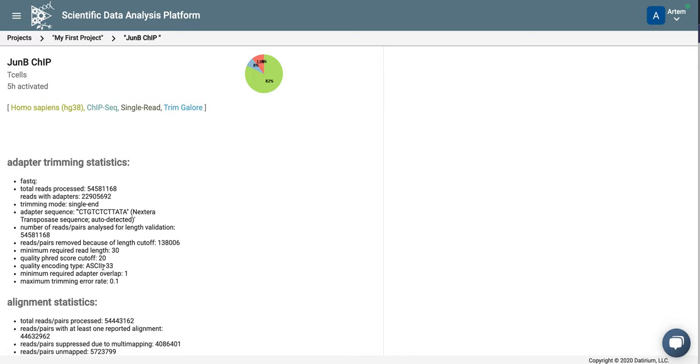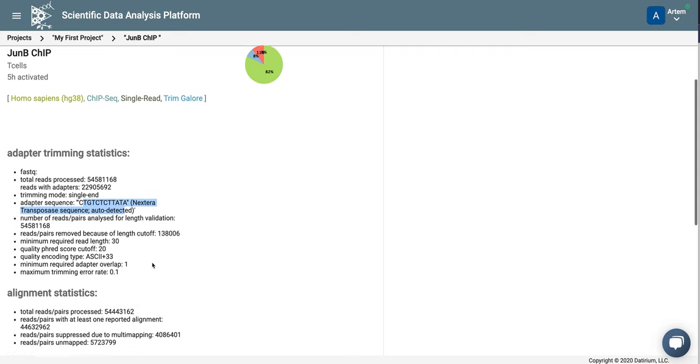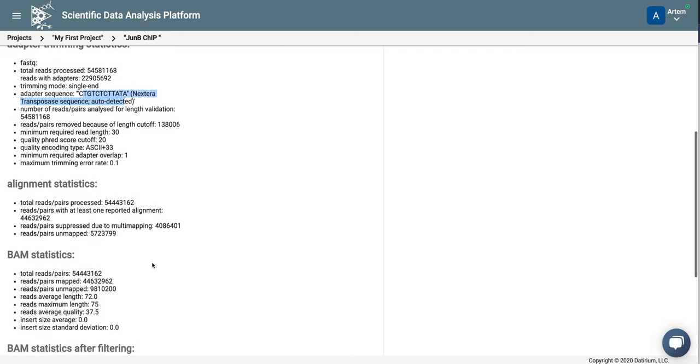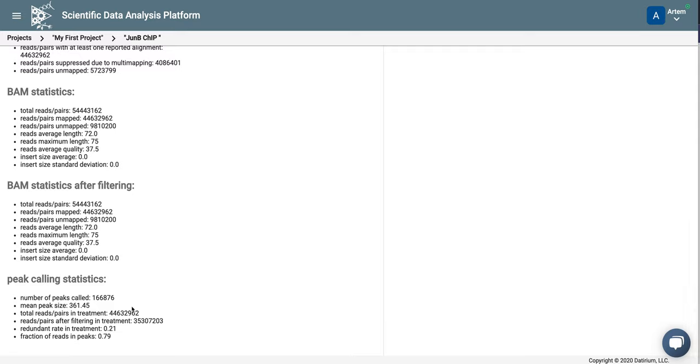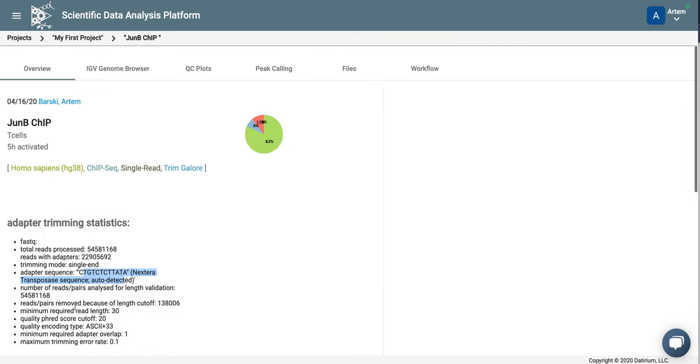This is the trimming statistics by TrimGalore. You can see TrimGalore detected Nextera transposase adapter sequence. This is good because we use chipmutation. Here is alignment statistics, BAM statistics, and peak calling statistics. You can see we got a lot of peaks called.